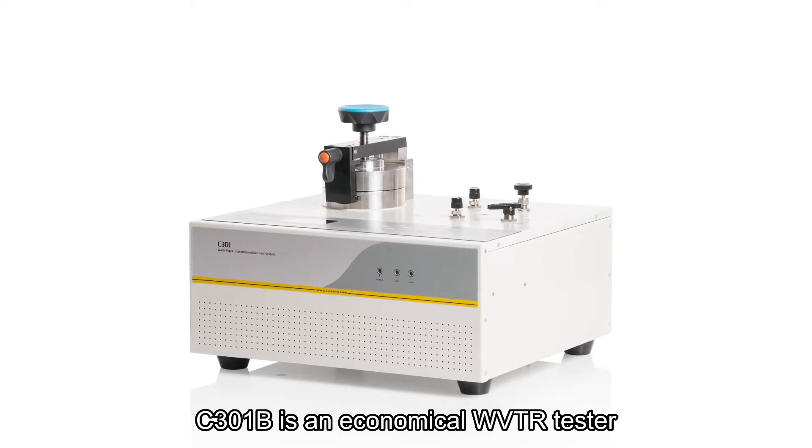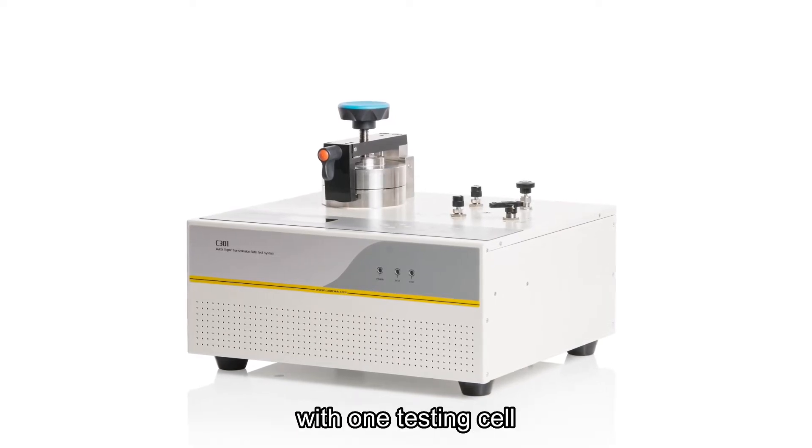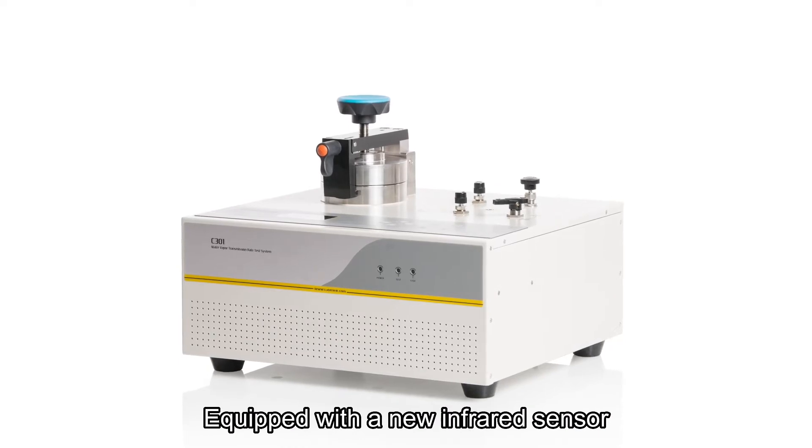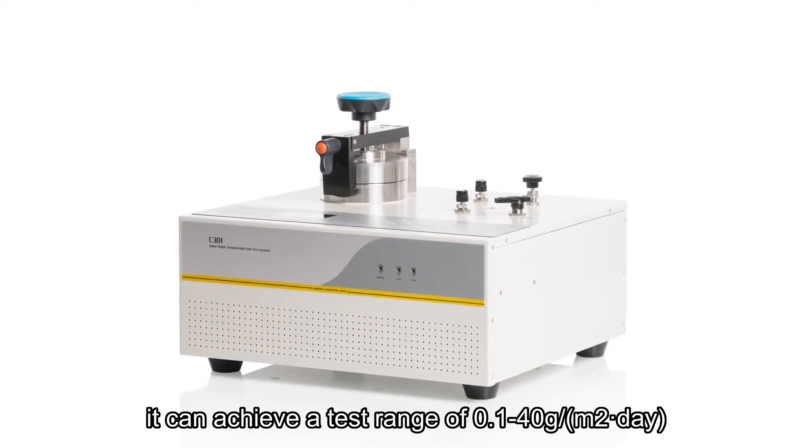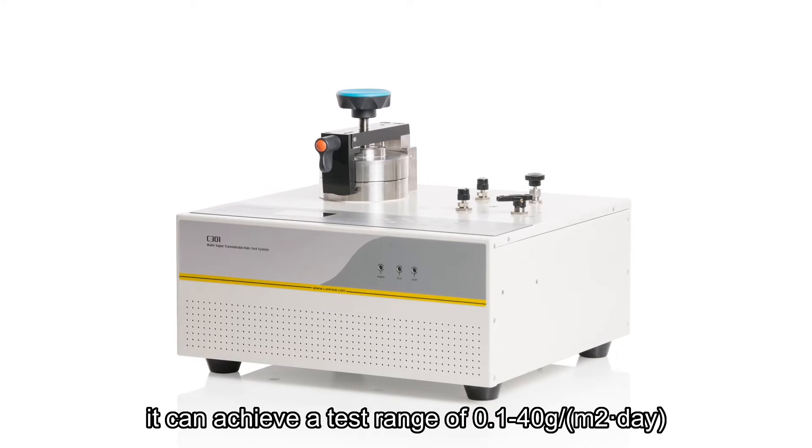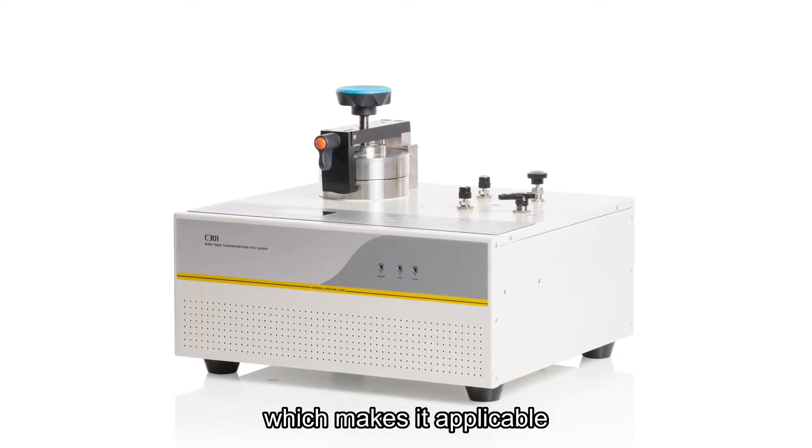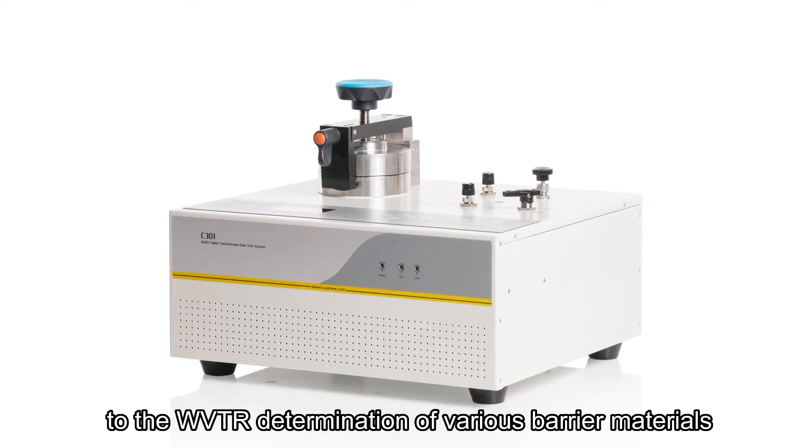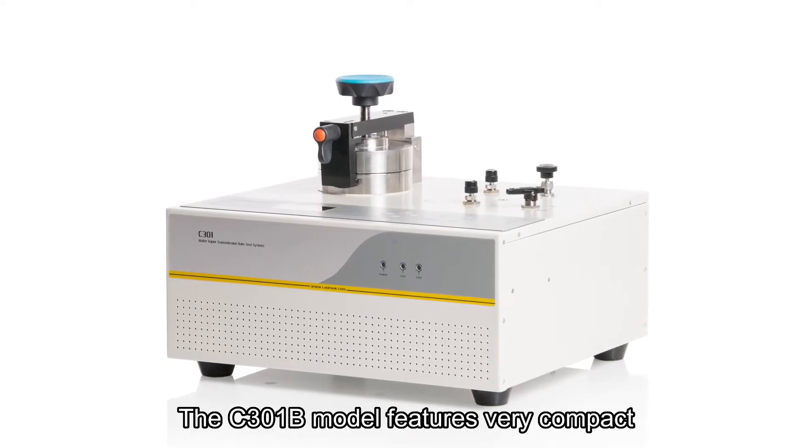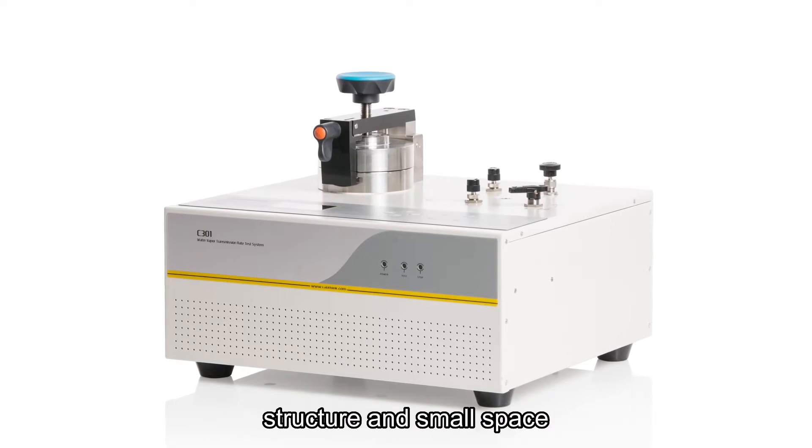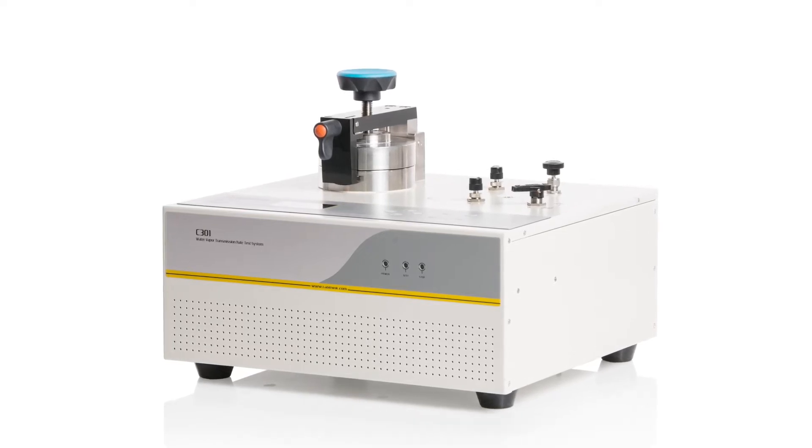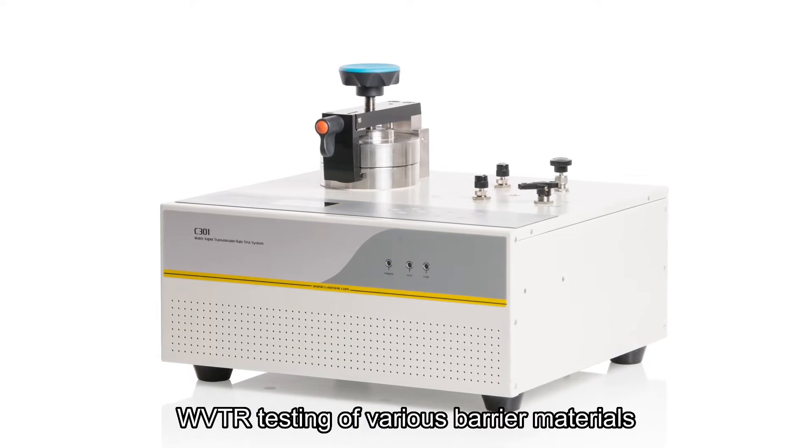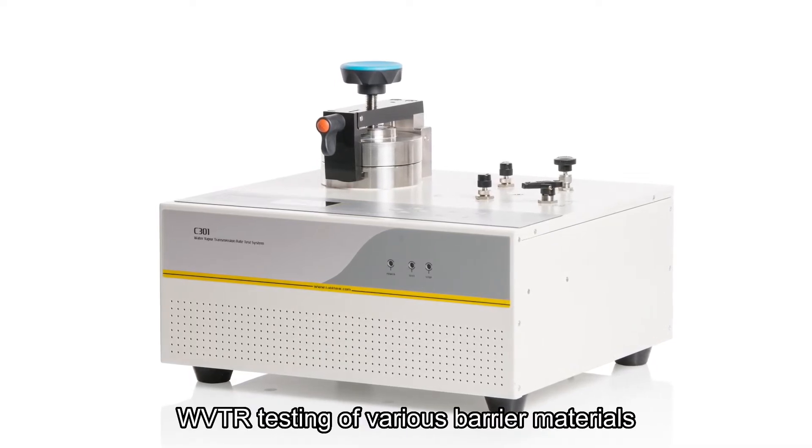C301B is an economical WVTR tester with one testing cell. Equipped with a new infrared sensor, it can achieve a test range of 0.1 to 40 grams per square meter per day, which makes it applicable to the WVTR determination of various barrier materials. The C301B model features very compact structure and small footprint. The model is also very economical for its powerful functions.